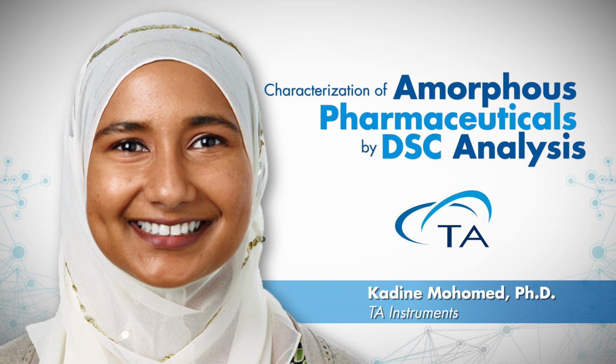So if your sample goes through low temperature transitions that occur very close to room temperature, then my suggestion would be to change that standby temperature to somewhere between 20 to 25 degrees. Standard laboratory conditions might be around 23, so change the standby temperature to 23 degrees and then load your sample into the cell.